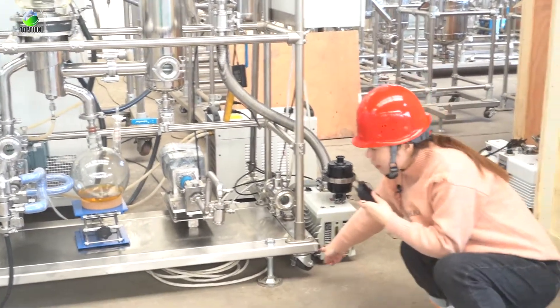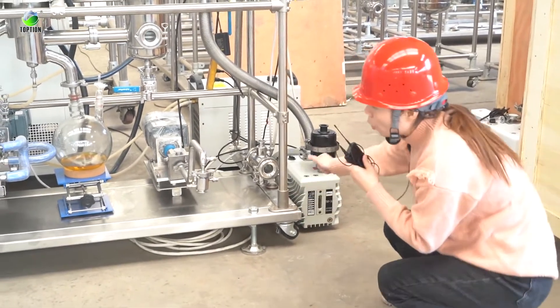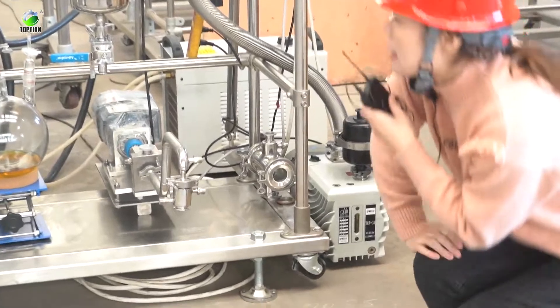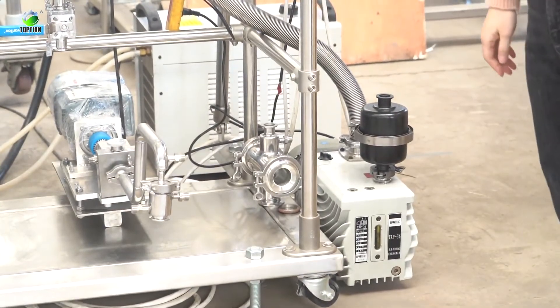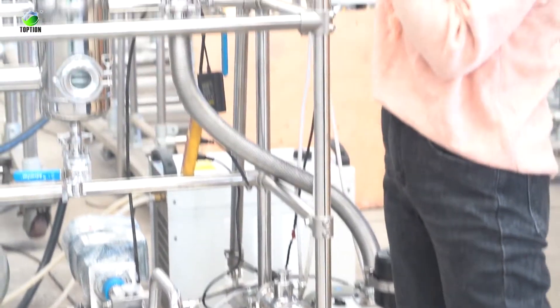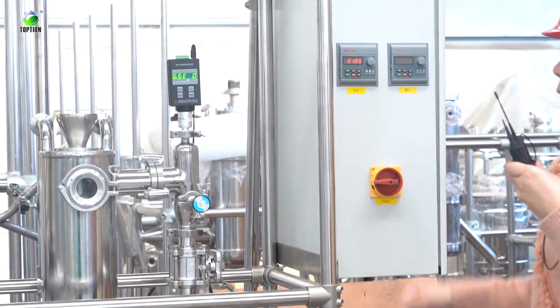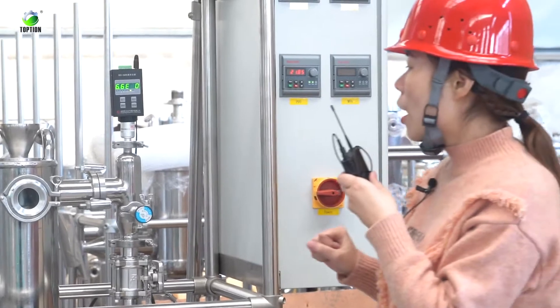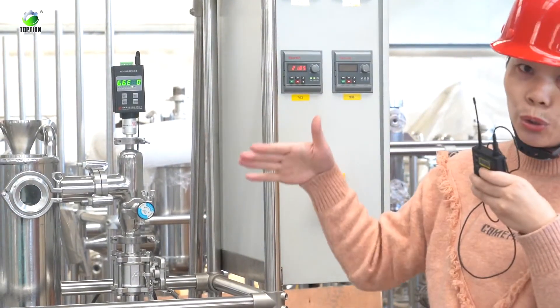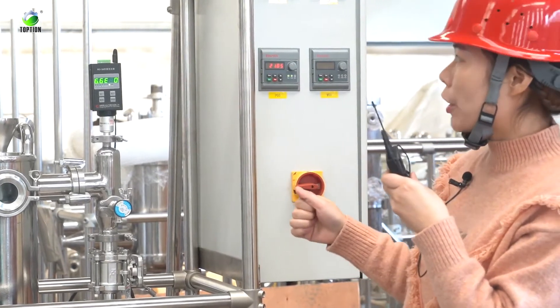On top of the frame you can see there is a swing arm, so you can move the stage left or right as needed. Behind the unit there will be a chiller, heater, or heating-and-cooling circulator which controls the whole temperature.